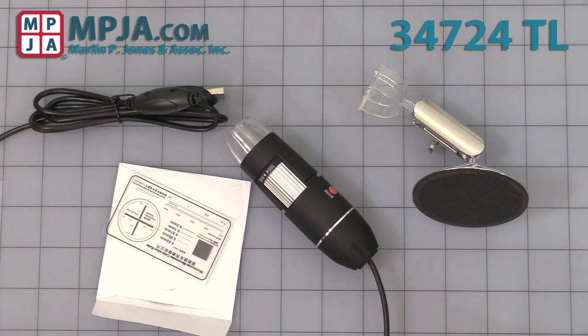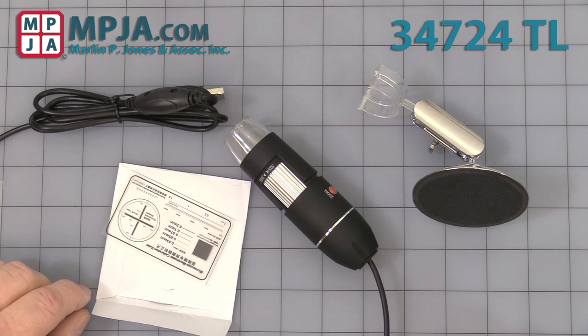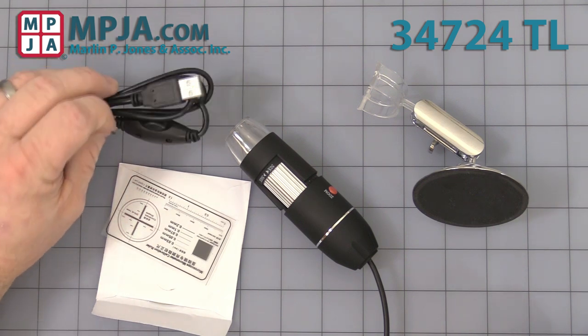Hello, today's video is on stock number 34724 TL, the color CMOS magnification camera, a USB magnification camera.